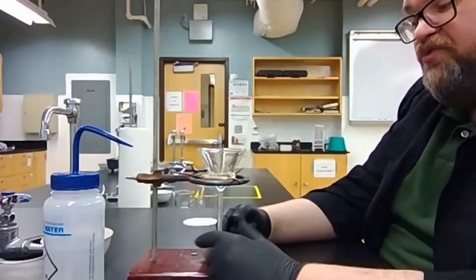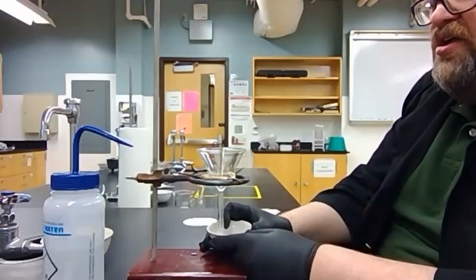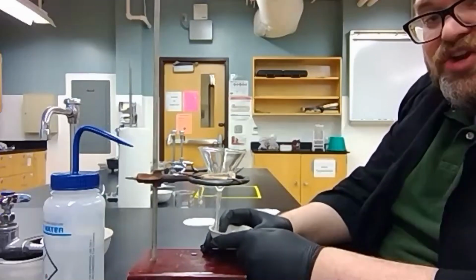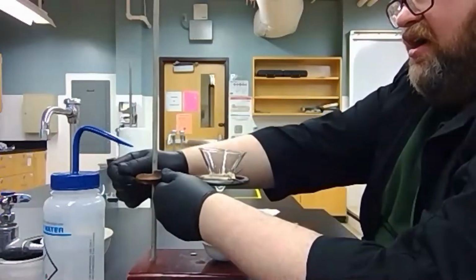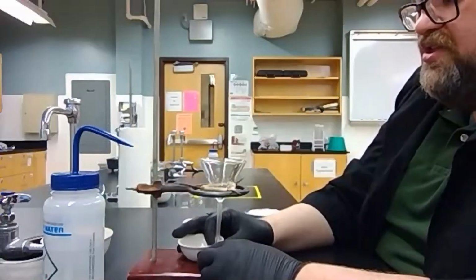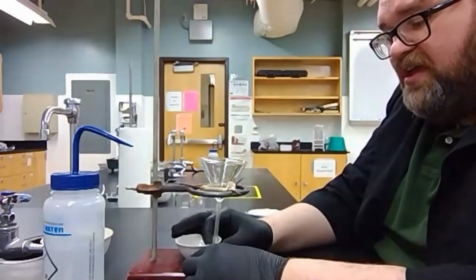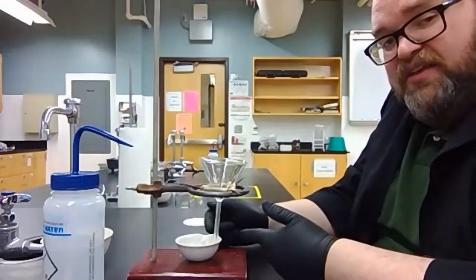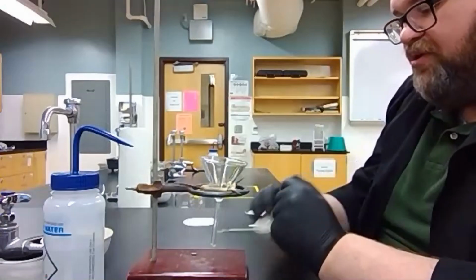Now I need to lower the funnel into the evaporating dish. I want the cut edge of the funnel to be pushed against the side of the evaporating dish, and I want it to be about 2/3 the way up the side of the evaporating dish. So I've got to lower this down, way further down. About right there will get me there. And then I'm going to push this to the side itself. We're doing that because we want the drops that come out of the funnel to not drip and splash. We want them to gently flow down the side of the evaporating dish.